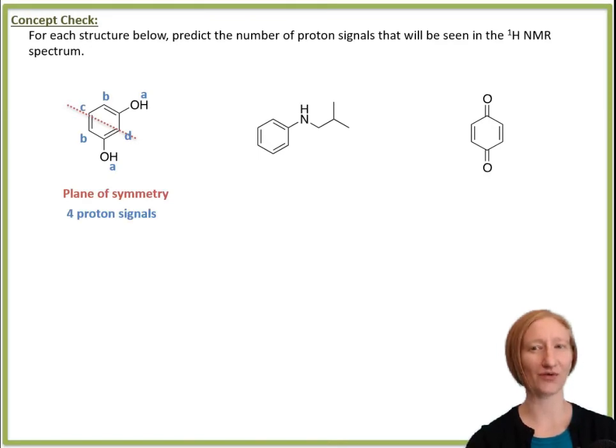And remember that although it looks like I'm labeling carbons here, I'm really labeling the hydrogens bound to those carbons. So if you need to draw them in to be sure you're assigning hydrogens, then please do. And this is an example of how we can draw in and indicate the hydrogens, denoting each as HA, HB, HC, etc. In the second example, I'll go through and assign hydrogens more quickly.